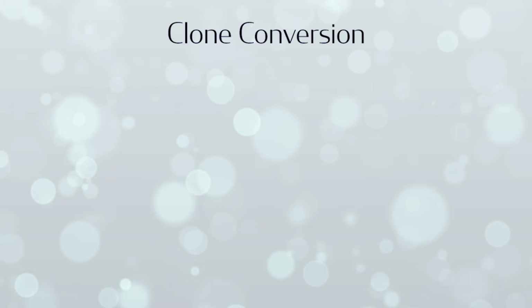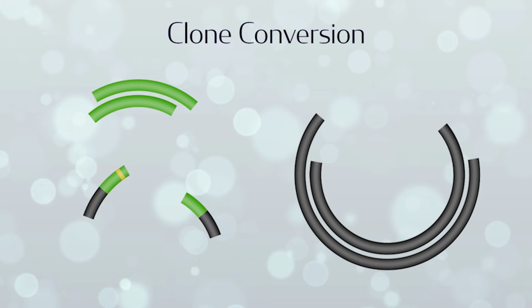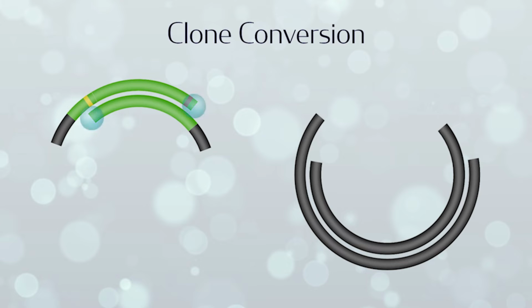You can play around with this concept by adding extra sequences to the oligo, like an extra stop codon, linker, or even larger sequences. The DNA polymerase proofreading activity even allows us to delete existing stop codons or other sequences in the Golden Gate part. If there is a mismatch between the oligo and the Golden Gate part, the DNA polymerase will start with a 3' chew back before polymerization.